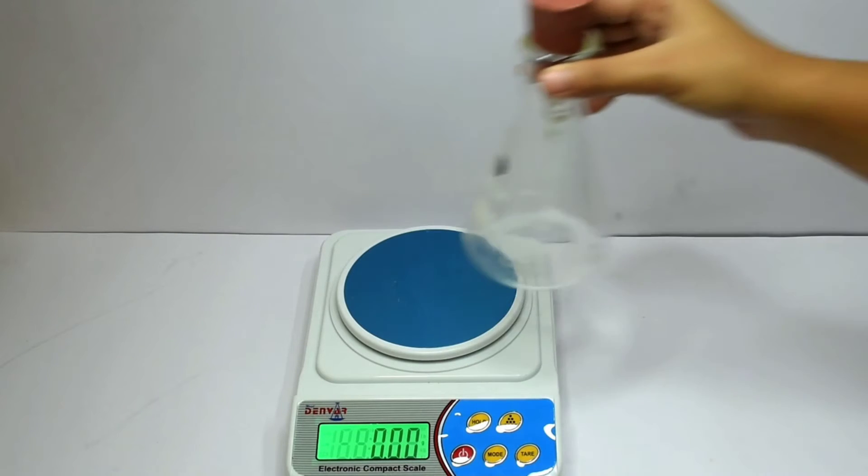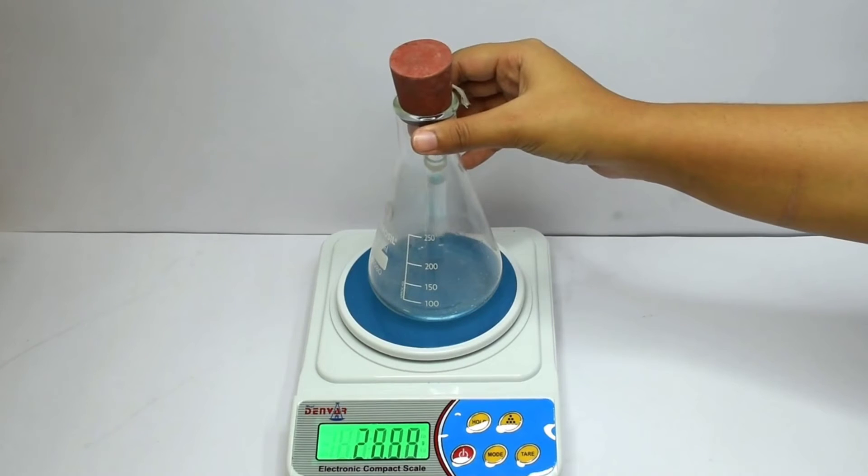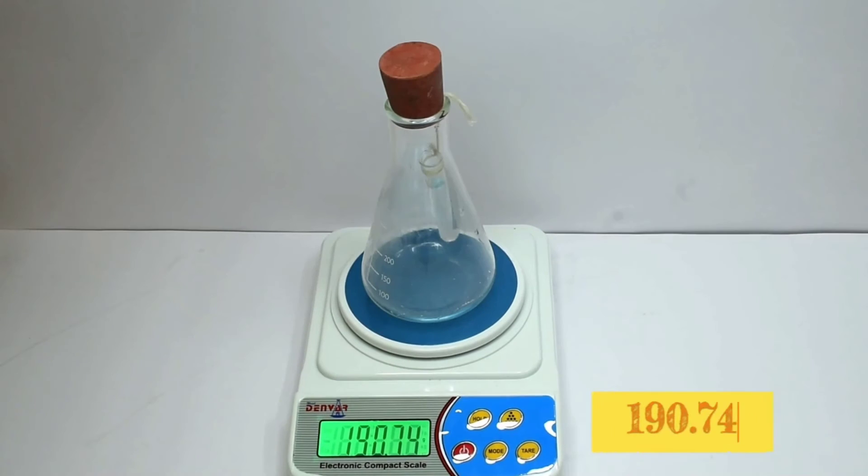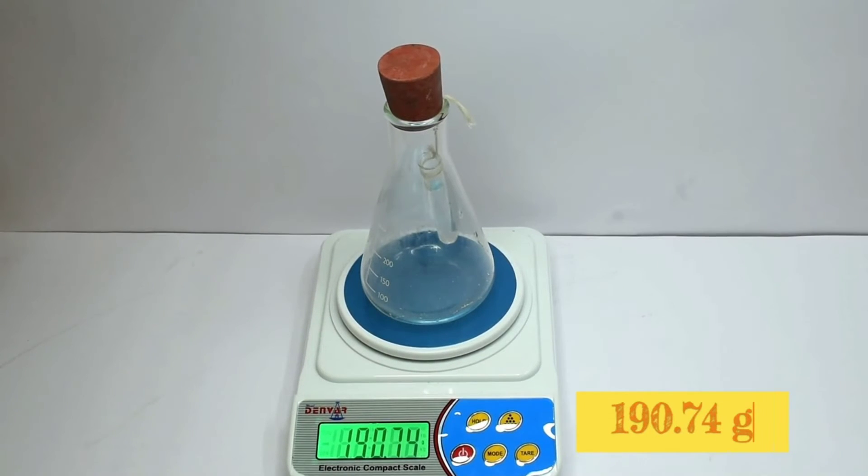Make sure that the solutions do not mix yet and carefully place the conical flask on a digital weight machine. As you can see, the weight of the system before the chemical reaction is 190.74 grams.